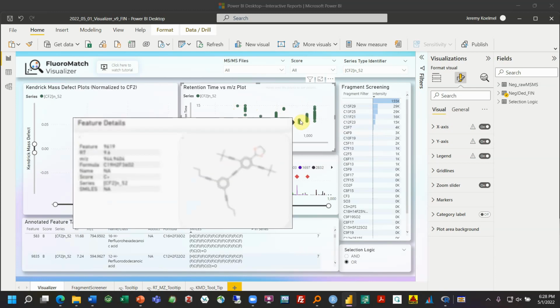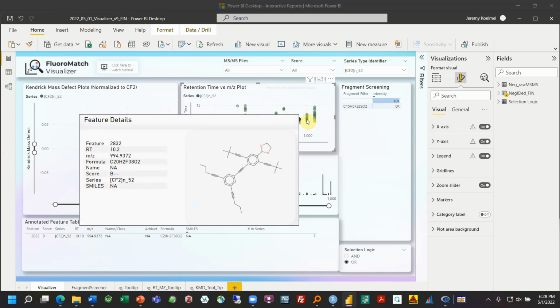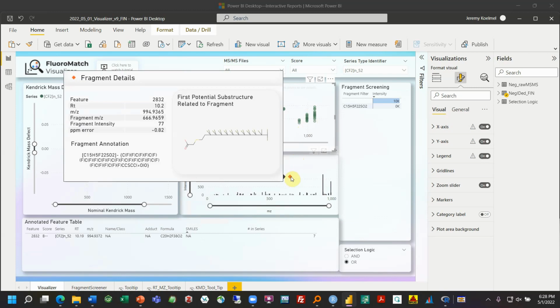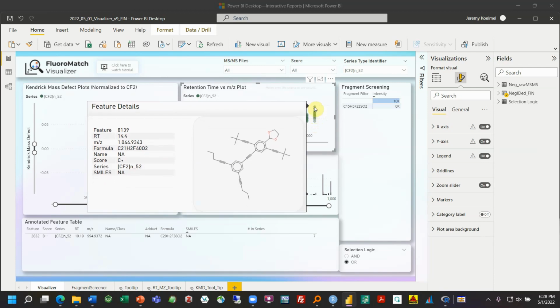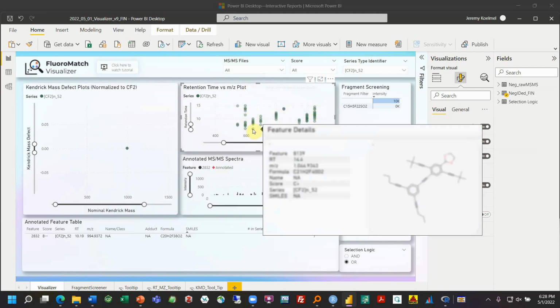Same thing over here, we can look at and see if everything seems to be C+. We do see a B-, which means that there was some fragmentation annotation, but again, pretty low confidence, and it is a high mass fragment that could be matched with other kinds of formulas. So again, not necessarily a PFAS and definitely probably not a PFAS. So here we can see, okay, there's a bunch of noise out here. There's a bunch of noise out here. Maybe these as well.